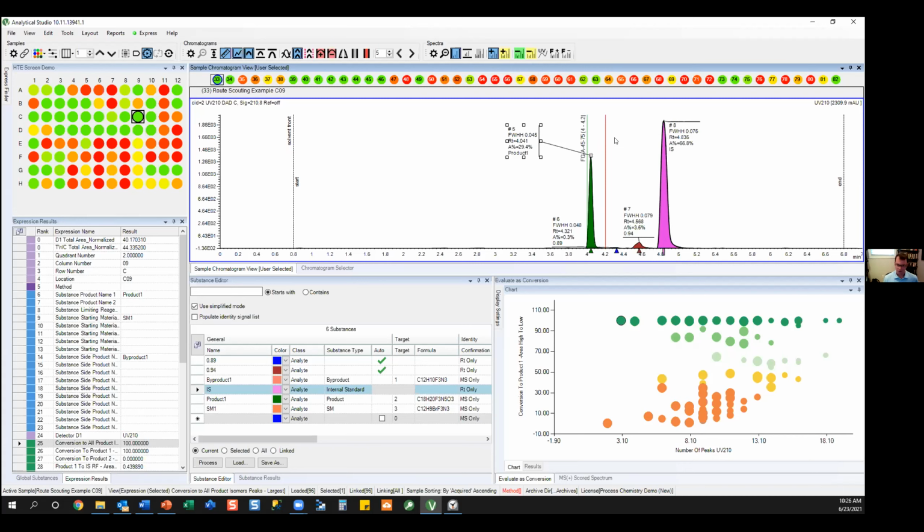So what we do is based on the retention time of a product peak or multiple peaks. We can also handle multiple product peaks in the case of isomers. Based on this retention time, we select the appropriate gradient. And of course, we have a start and an end here. And then we overlay this on the chromatogram, the start and end times, and also the name of this particular gradient that is selected.